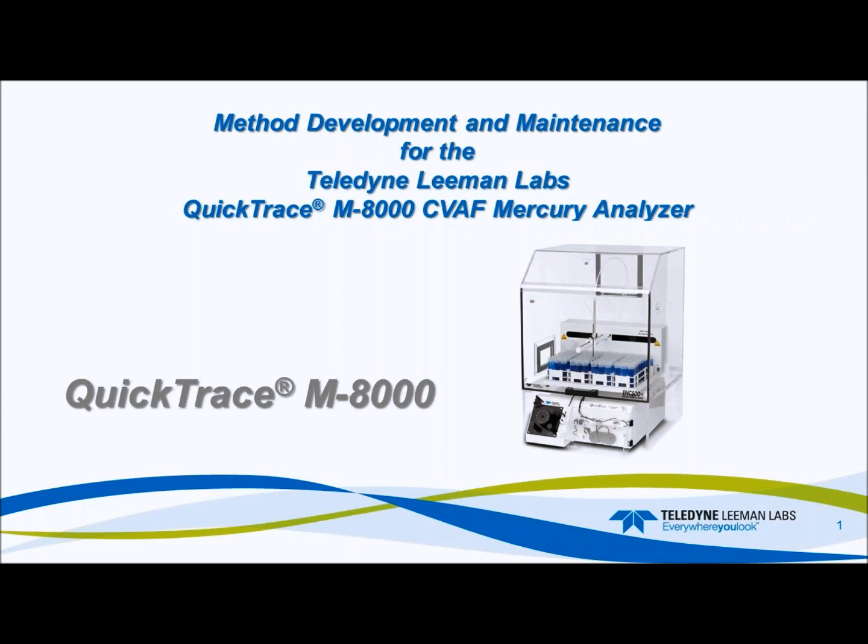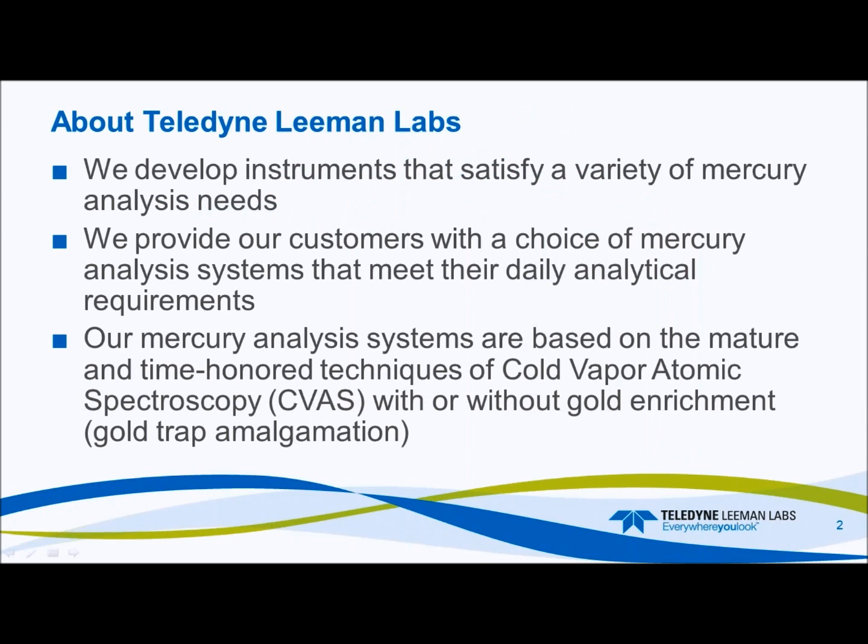Good morning, everybody, and thank you for attending. This is a series of webinars that we've been producing at Teledyne Leeman Labs since late last year, and this is the fourth in the series. The previous one for the M8000 was QuickTrace software and how to develop methods in the software. So now I'm going to take it a step further, and I'm going to actually show you how we do it and how we change the timing to develop our methods.